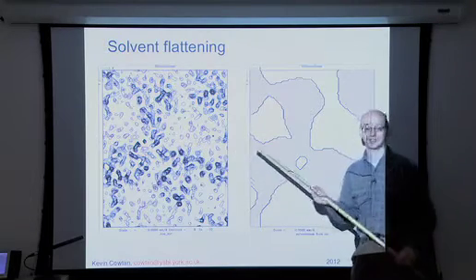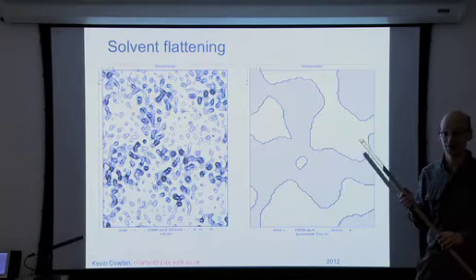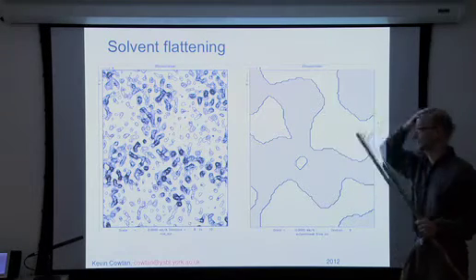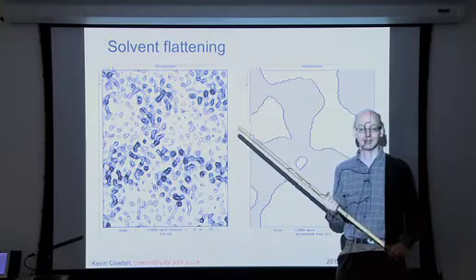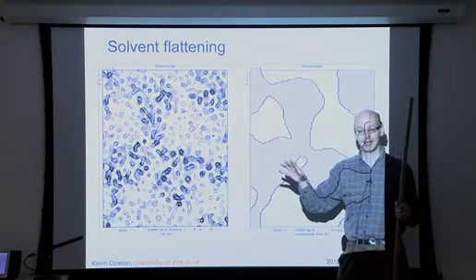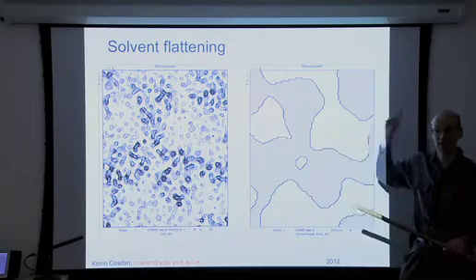So most of the features in your solvent early in the calculation are actually noise. They're not ordered waters. Because of that, if you just flatten out the solvent, you're getting rid of the ordered waters, the ordered peaks, but you're also getting rid of the noise. And when your phases are poor, you're getting rid of a lot more noise than signal. As a result, on aggregate, the map has improved.